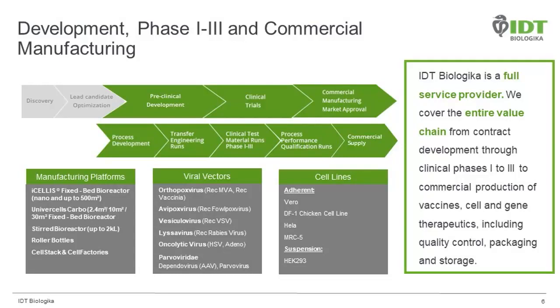In this presentation, I want to touch base on our general platform principles with our recombinant MVA platform as an example for our fit-for-purpose aseptic processes and capabilities, covering strategies to boost viral vectors or viruses like Vaccinia, orthopox virus, CMV, and many others.